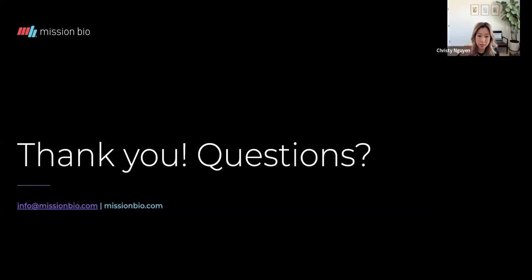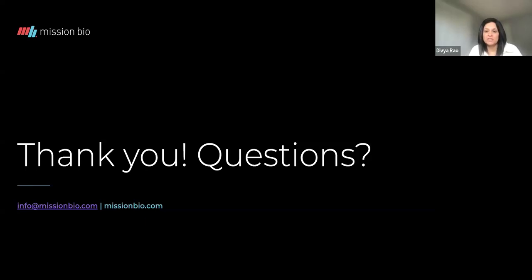Great. Thank you, Dr. Bowman. And I think this question is for Divya. Understanding next generation sequencing, NGS, for DNA mutation screening is straightforward, but could you please explain how it applies to proteomic analysis? Next-gen sequencing for proteomic analysis using our platform?